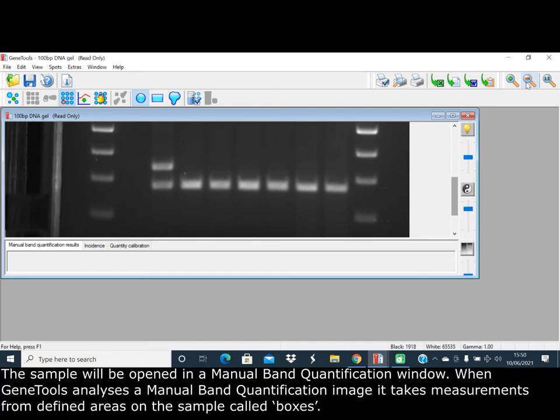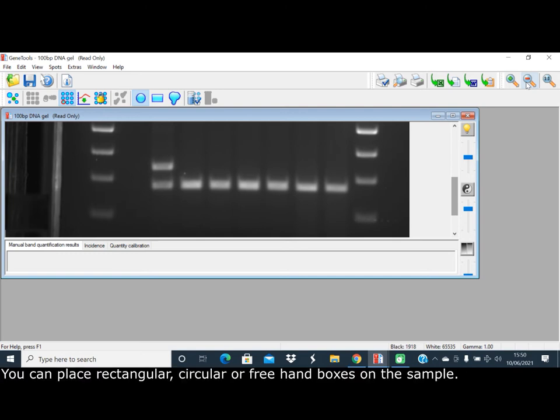The sample will be opened in the spot block manual band quantification window. When GeneTools analyzes a manual band quantification image, it takes measurements from defined areas on the sample called boxes. You can place rectangular, circular, or freehand boxes on the sample.